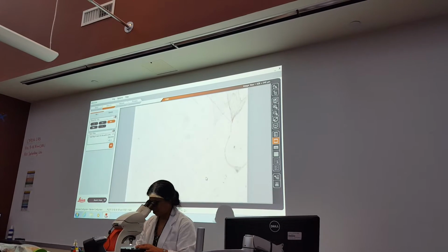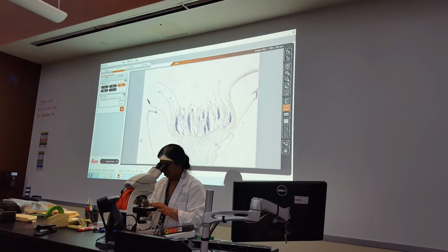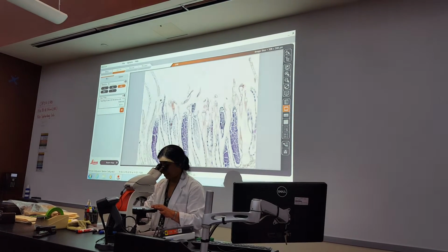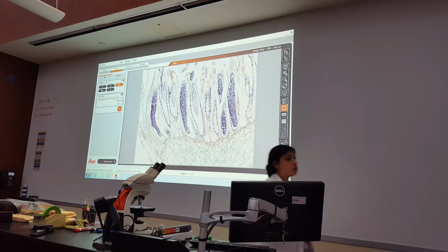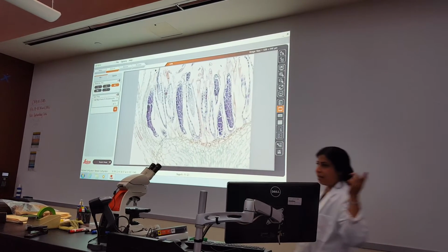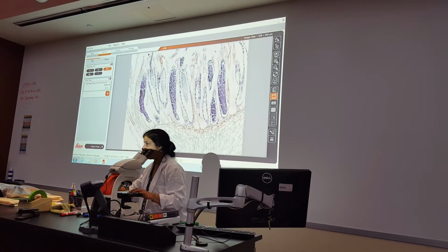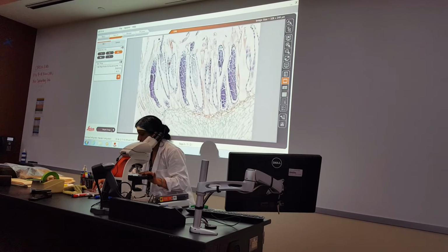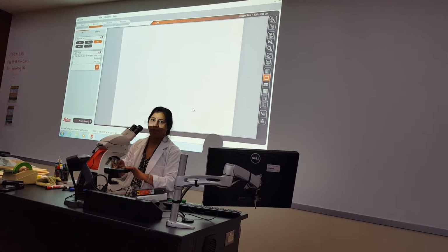Did you see them? Yeah. Look at that. That's the moss Antheridia. What do the Antheridia bear? Sperm. Now the sperm will swim to the egg from the previous slide, and then what do you make? The zygote will grow into the capsule. The dark purple, 405, what is that? Yes, the purple is sperm. Okay.